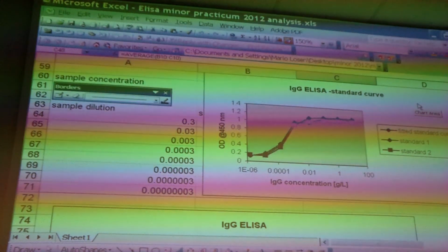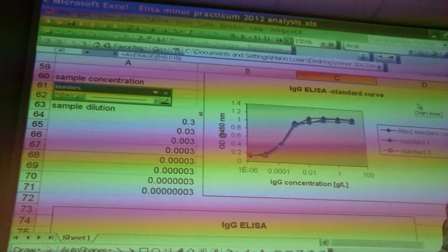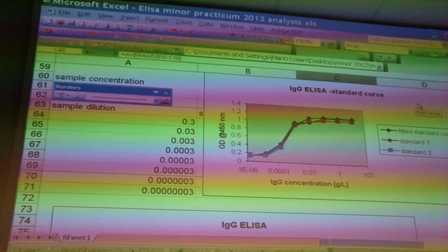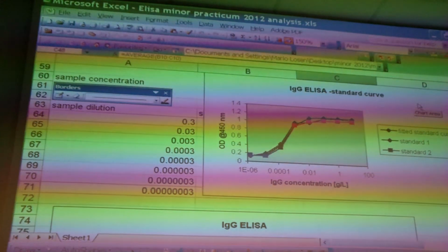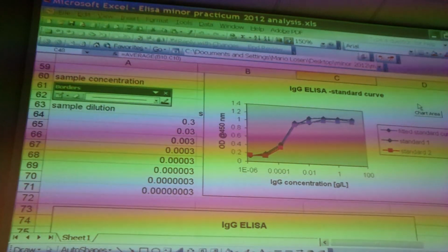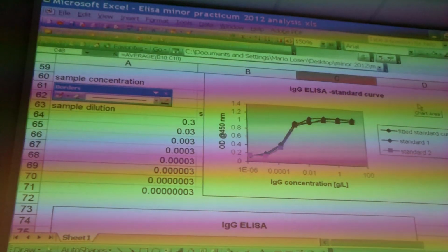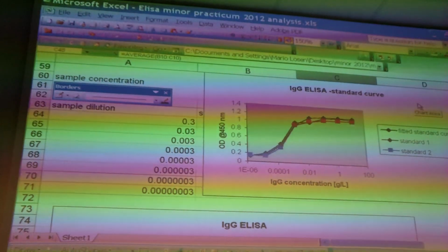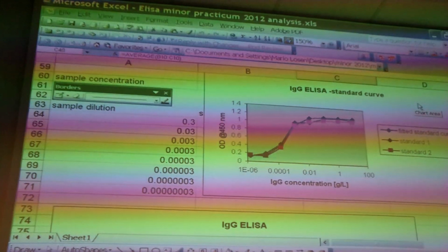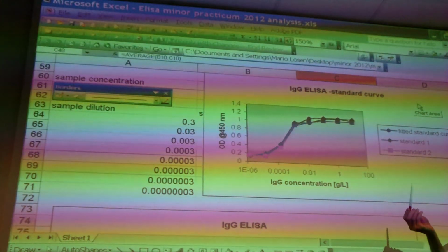So why doesn't this go up like this? Why does it stop at some level? Ideally the calibration curve starts at 0 and goes indefinitely, no matter how high you want it. So why does it never get above 1.2? It's saturated. Something is going to saturate it in any case. Even human population growth is going to saturate at some point. It's not going to grow indefinitely. You can add double the amount of substrate, and in this case probably the signal goes double, but it will be saturating in any case at some level.